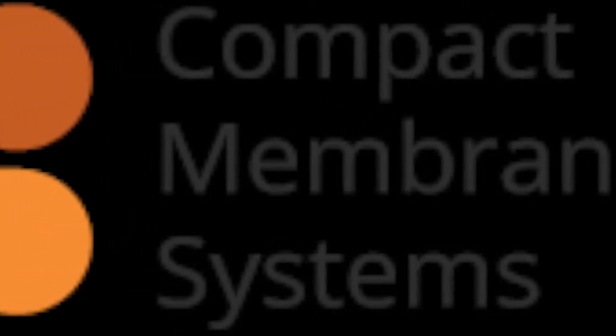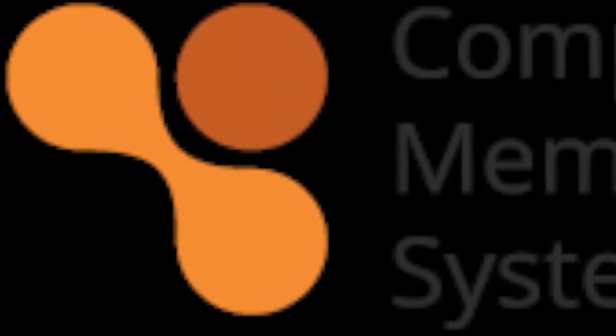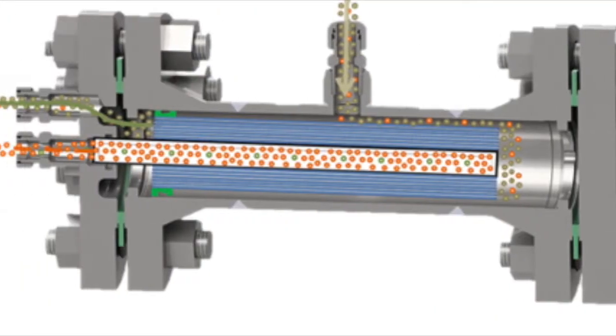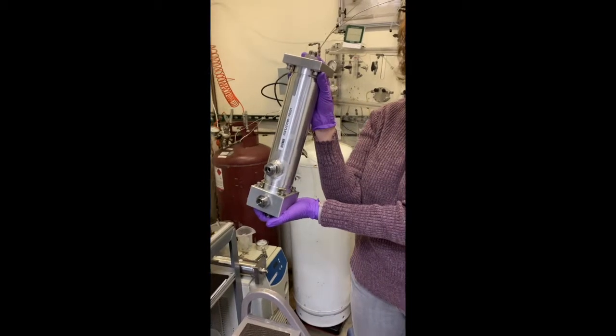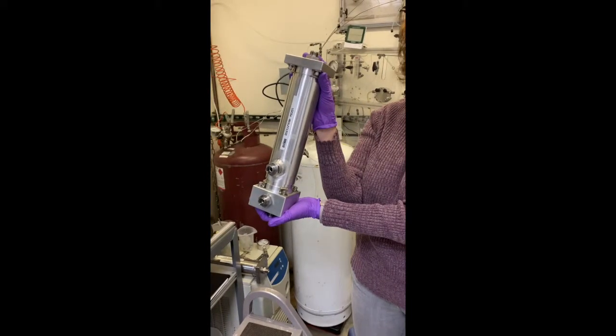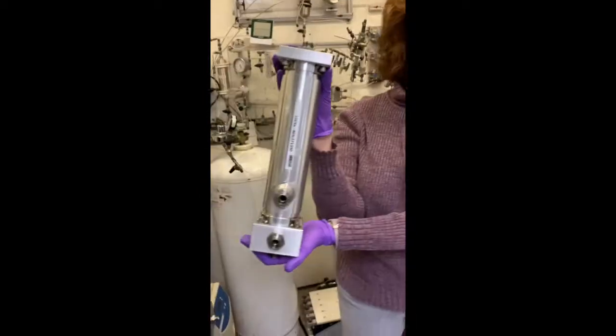Compact Membrane Systems prides itself on being a leader in the field of difficult chemical separations. Our proven membrane technology is chemically resistant and its modular design allows systems to fit into a variety of spaces. Today we are going to take a look at one of our solvent dehydration systems in action with the help of our R&D technologist Robin.